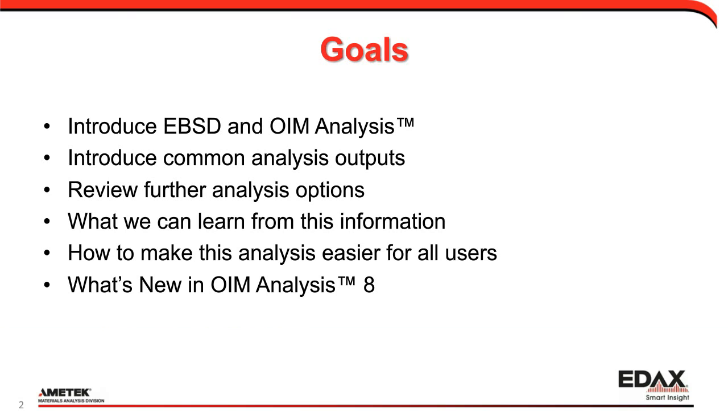Welcome, everyone, to the webinar, and thanks for attending. It's always tricky on a webinar, I think, because you're not quite sure who's going to attend. So when I thought about who might attend, I really targeted three groups. People who wanted to learn about OIM analysis in general, people who wanted to learn a little bit more about what OIM can do with their current work, and then people who might want to know what's new with OIM Analysis 8.